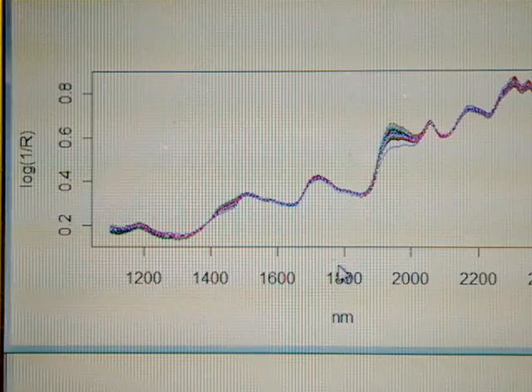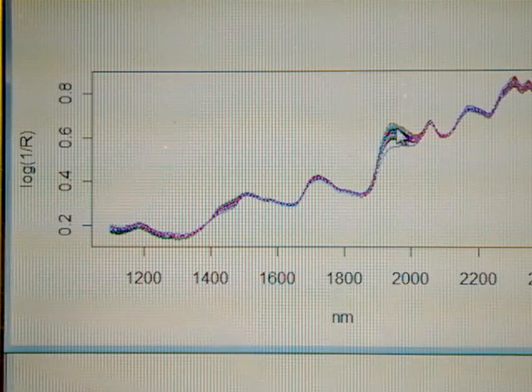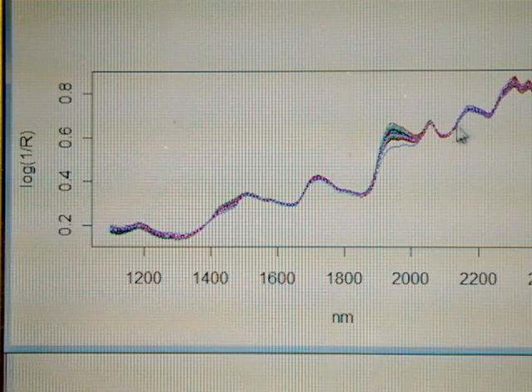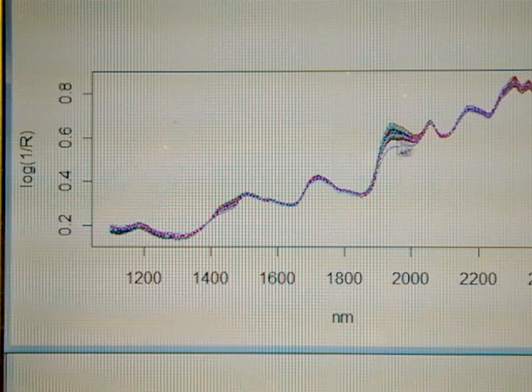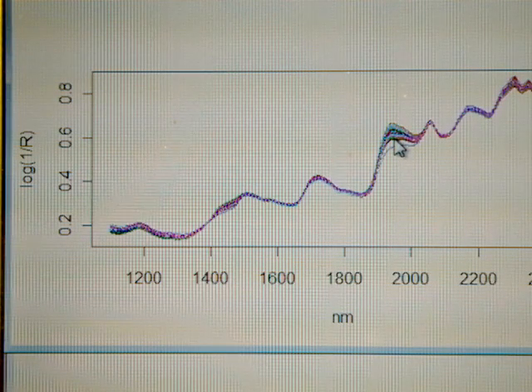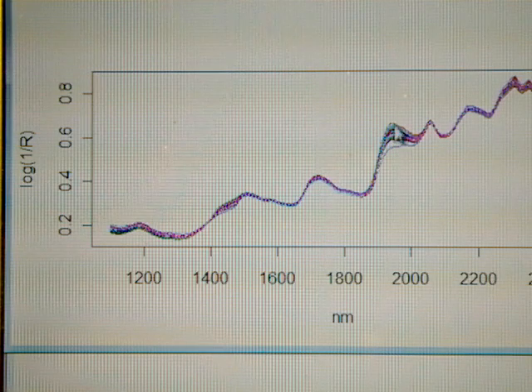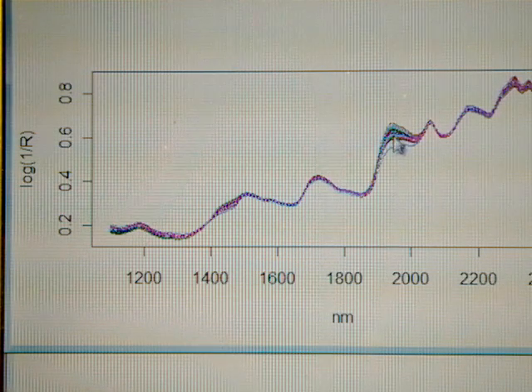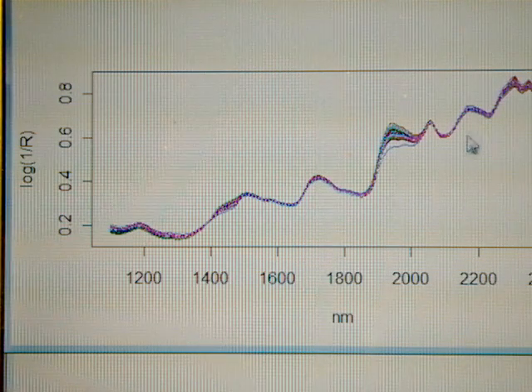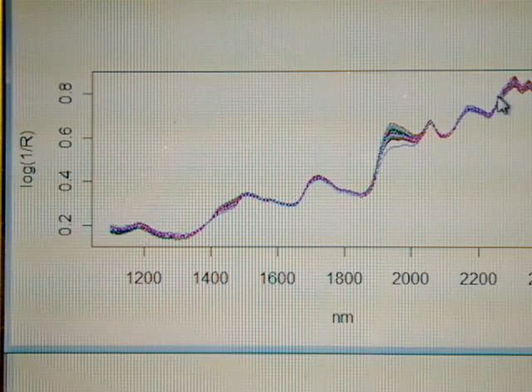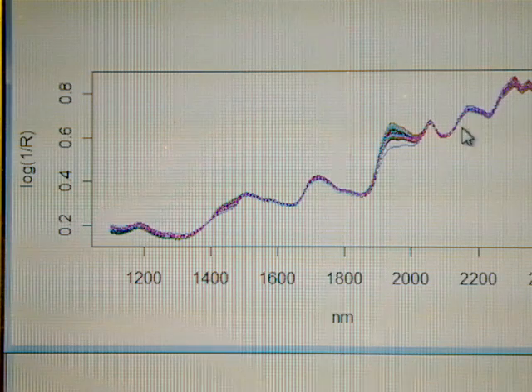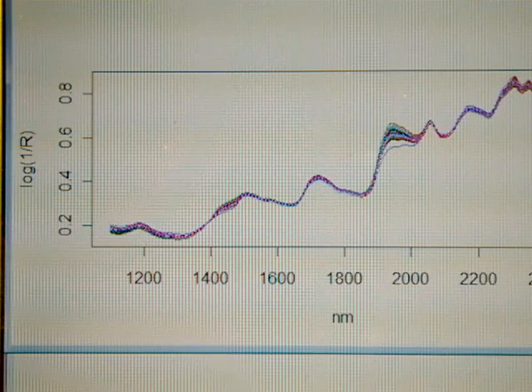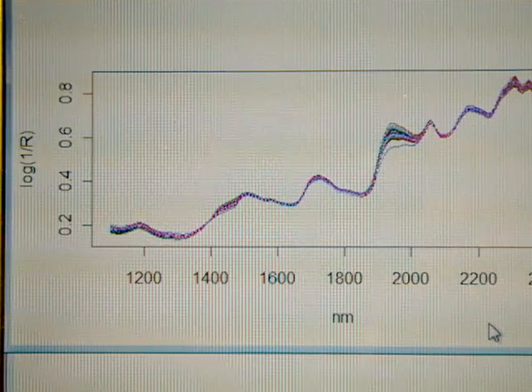So we see here there are, of course, separation, but in this case, for example, it is due to moisture, and to protein, fat, and so on.